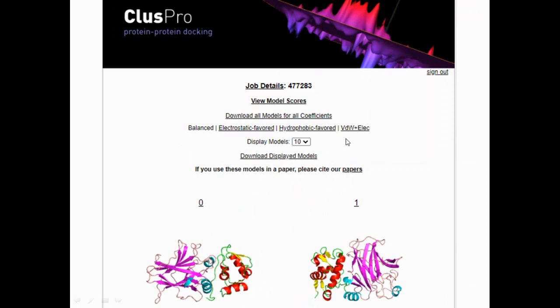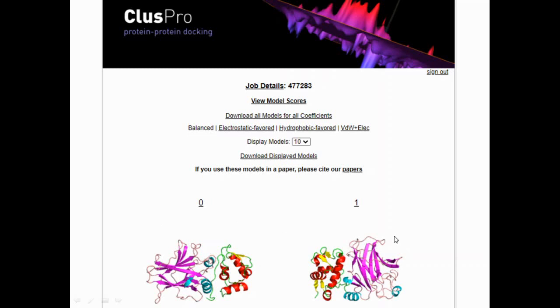You can see 'download all models for coefficients' and 'display model'. Here it is 10. When you drop down, you can select more models. You have your 0 model where you can see both the models being docked. If you scroll down more, you will get all the 10 models of protein chain 1 and protein chain 2. Now, which model to select? This is just the representation of what the models are, but we really need to know which is the best protein-protein docked model.